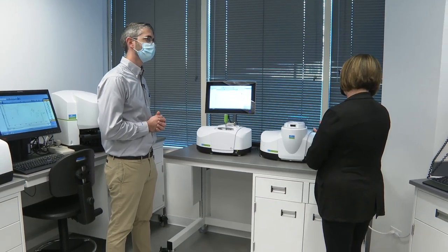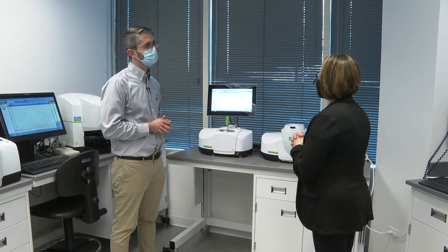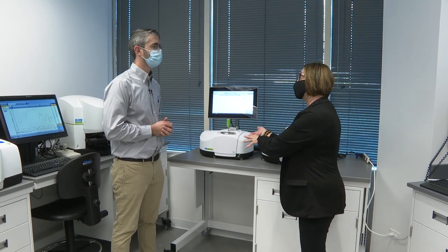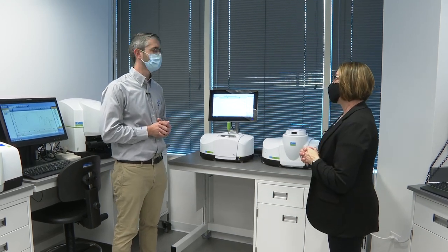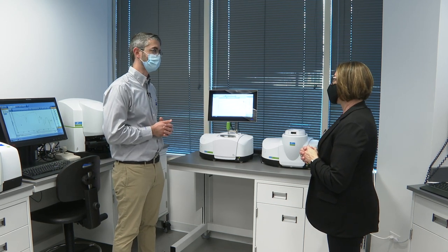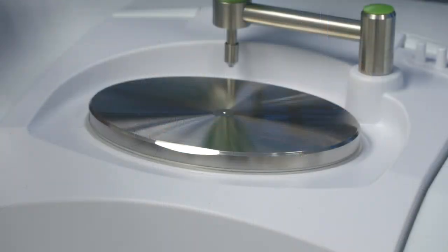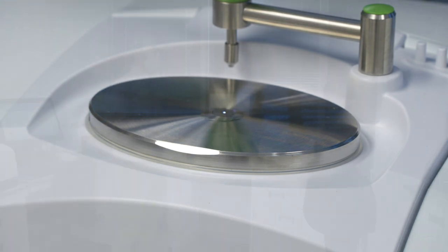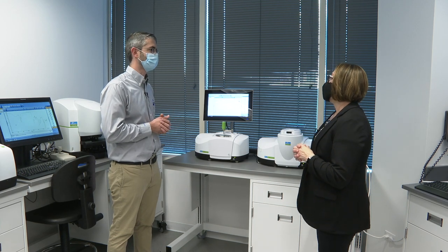I understand mid-infrared and near-infrared. Can you give a little bit of an example? I want to analyze hand sanitizer — I would use mid-infrared for that, correct? That's right. The analysis for hand sanitizer is very well done in the mid-infrared spectral range. It's very quick and easy to perform because you can use the ATR sampling technique where a few drops of the liquid are simply placed on the ATR crystal. The system can also be calibrated to quantify the ethanol content of a variety of hand sanitizer formulations.